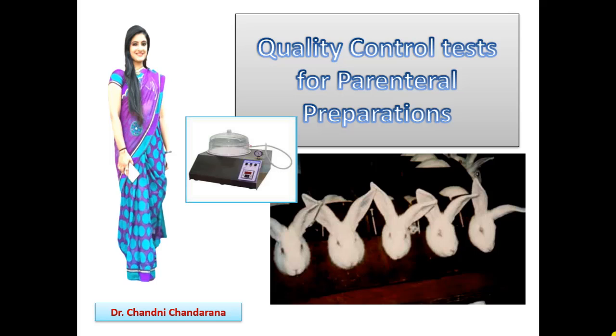Hello dear learners, today we will see the quality control test for parenteral preparations. As in all previous videos, we have already seen the details of parenteral preparations. Now it is very important to know how we can evaluate the parenteral preparations. So we will see the QC tests for parenteral preparations.